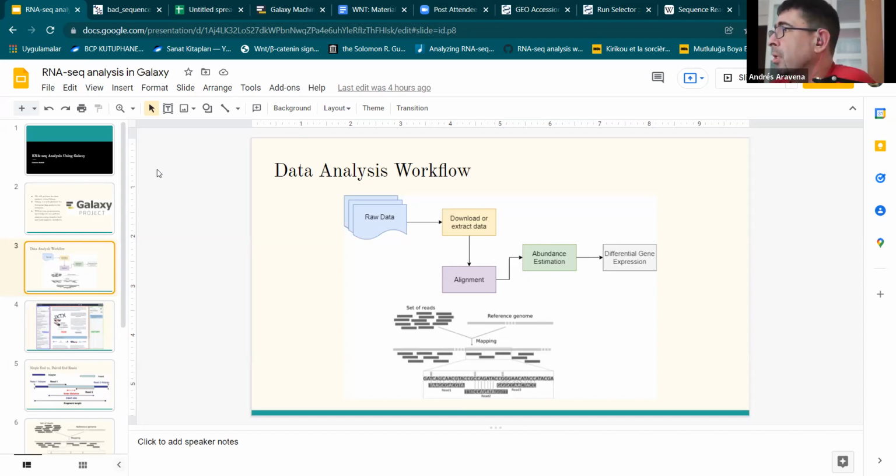So we have cases where a gene existed in one version and not in the other, and other cases where the same gene had two names in the other. So when we got rid of the ensembles, the problem was solved. At the end, we got to use a coherent version, the only one, but it was a headache.